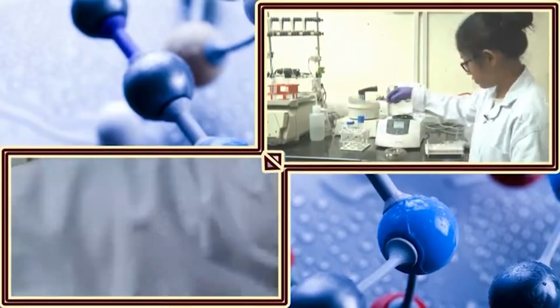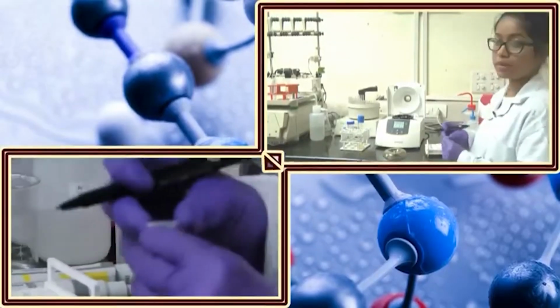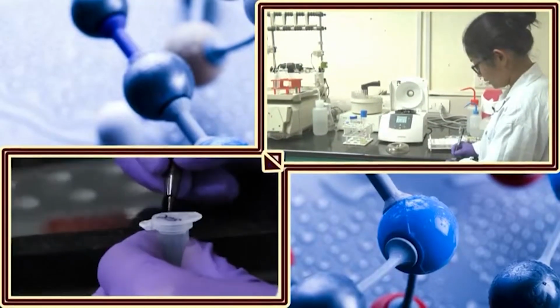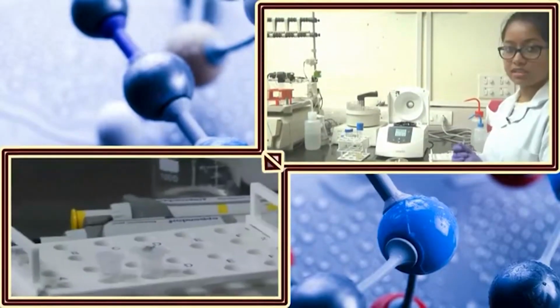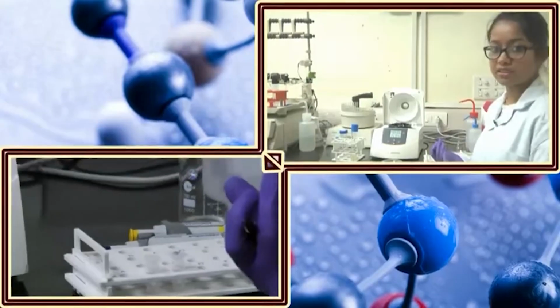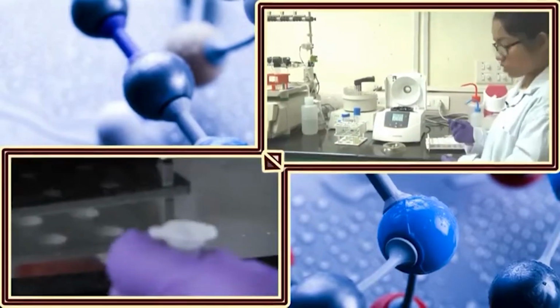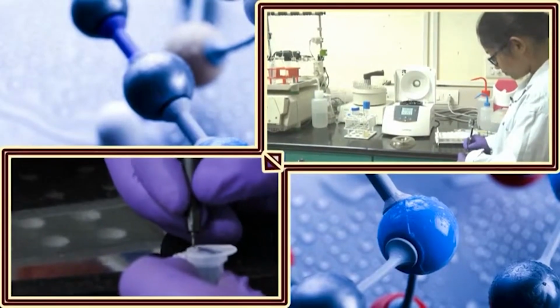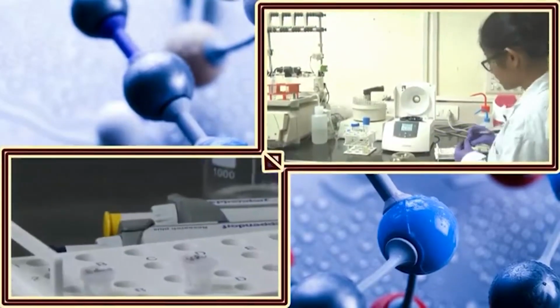Now I will take culture from that sample to another small centrifuge tube. Now those small centrifuge tubes also should be labeled properly. So here I have labeled the one centrifuge tube where I will take my culture and pellet down the cells. Since I am isolating plasmid from only one sample, I need a balance, as I have mentioned that in a centrifugation procedure you should always balance your sample. So in another tube I have to take water or any kind of sample of equal volume or weight. So I am writing on this tube as balance. In the balance I will not have any culture, only water to balance my sample.